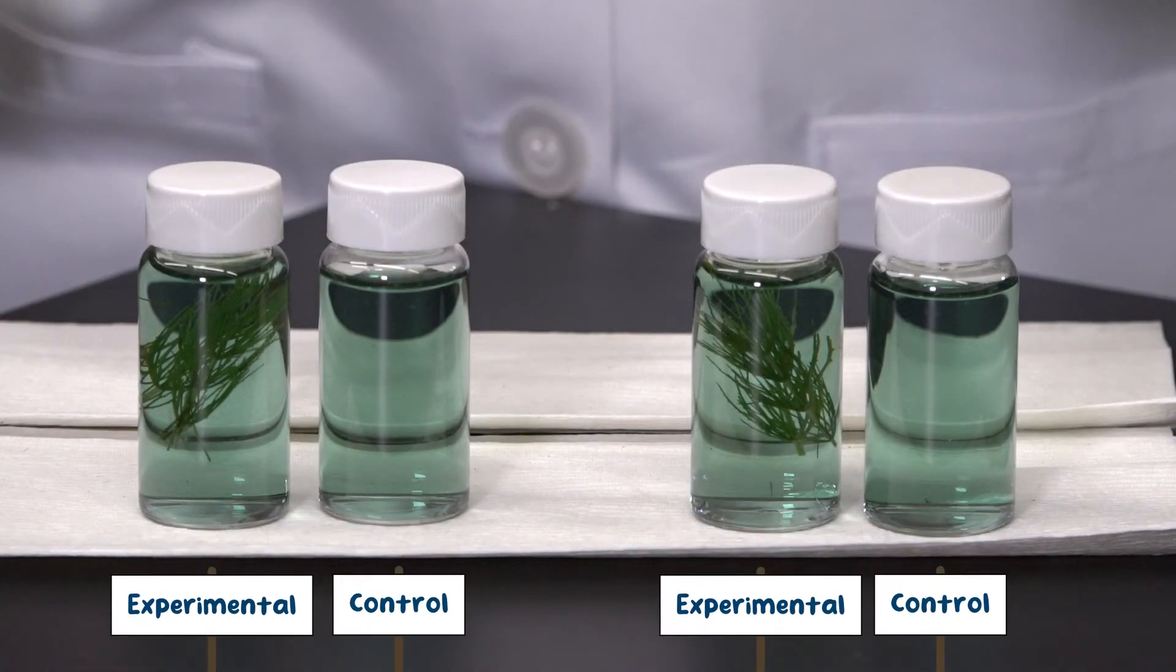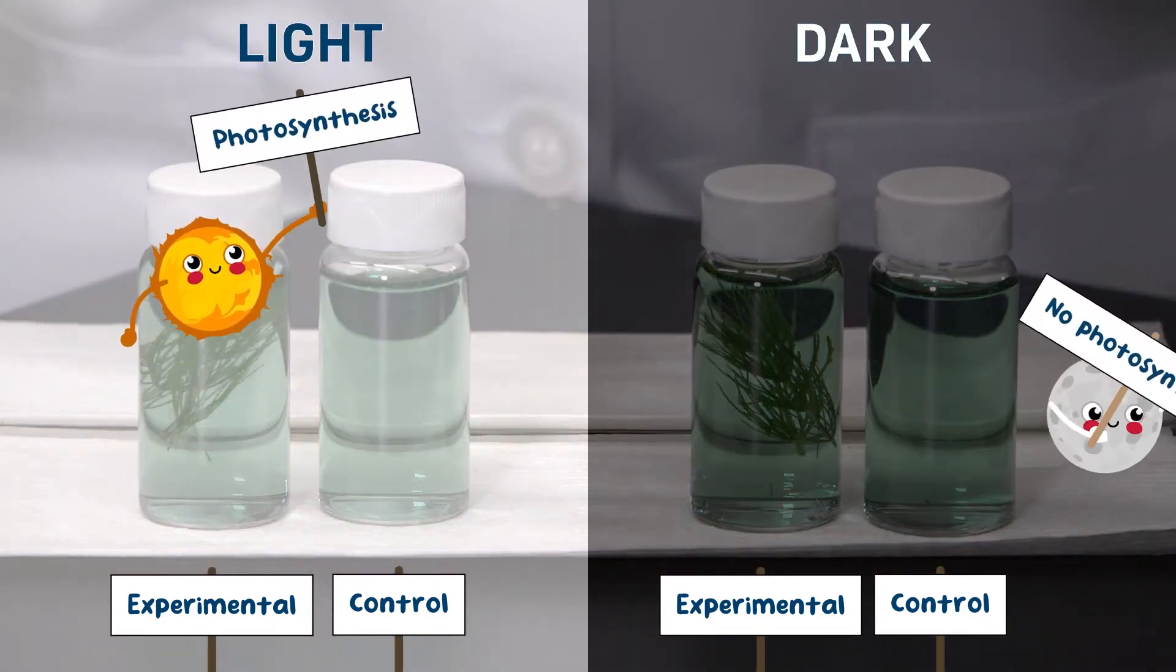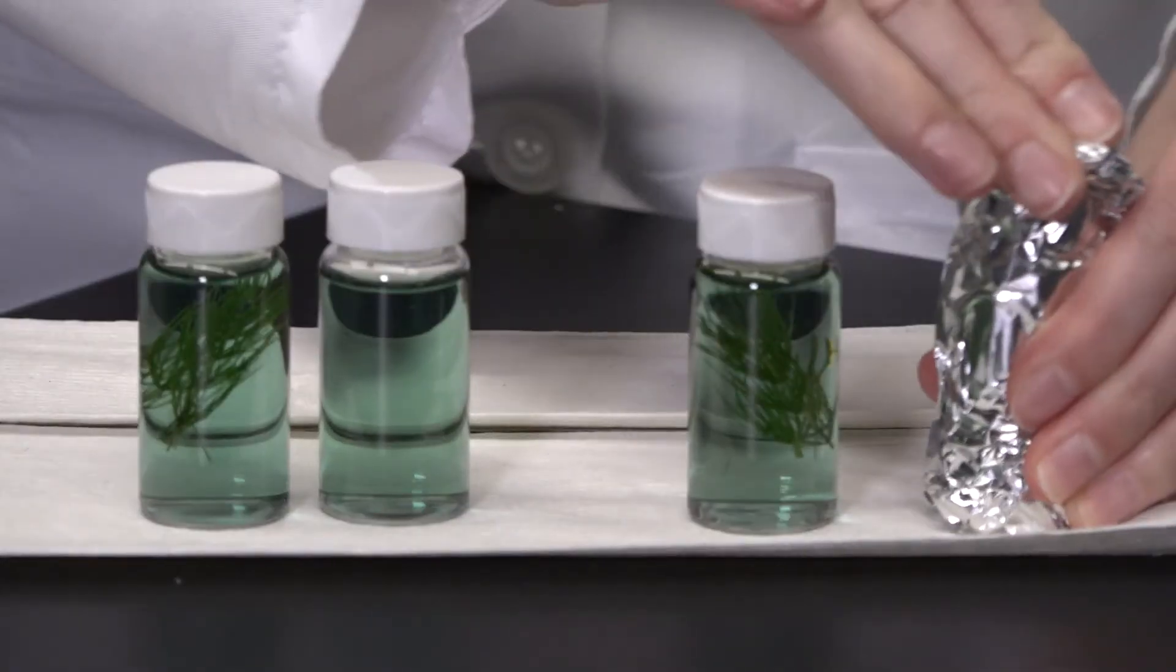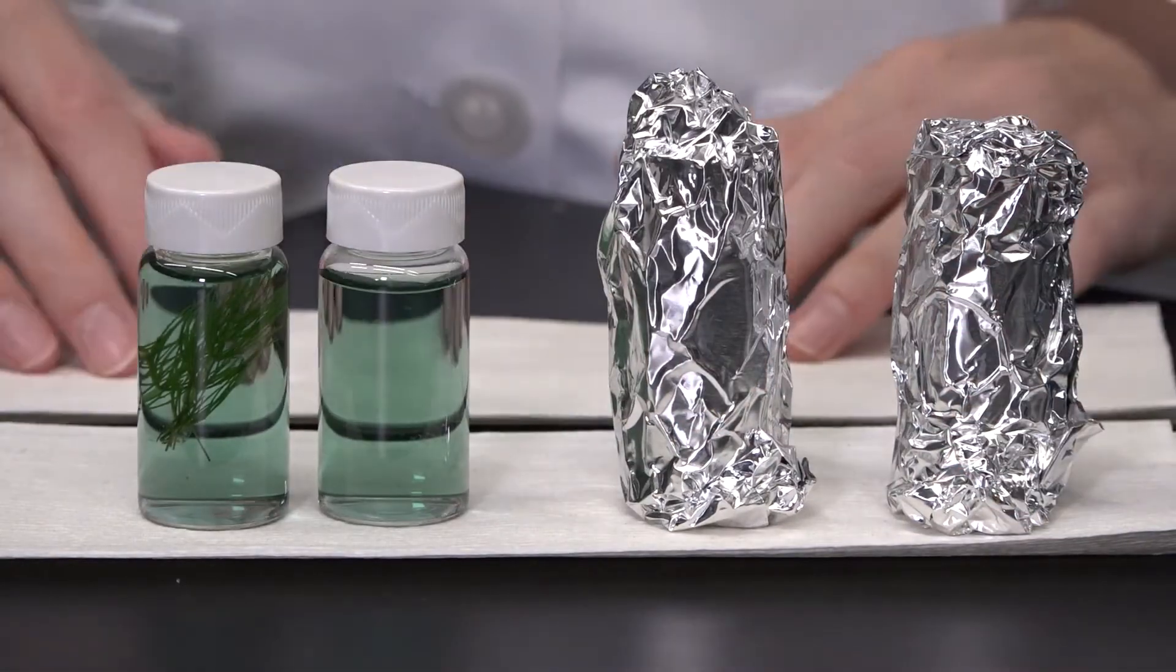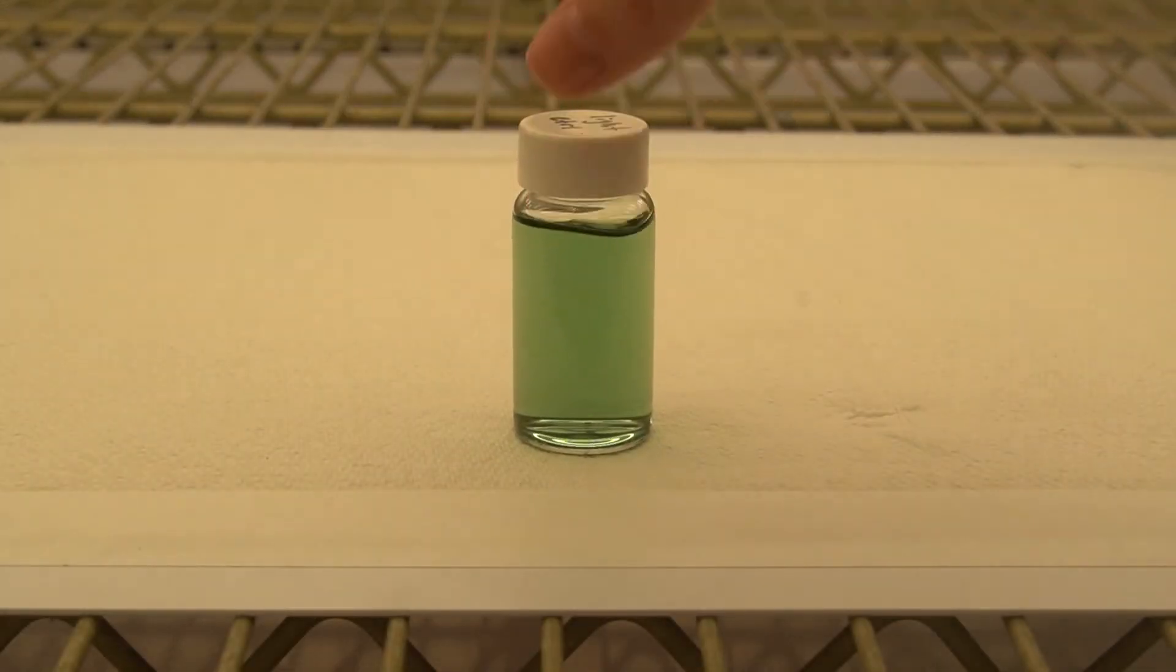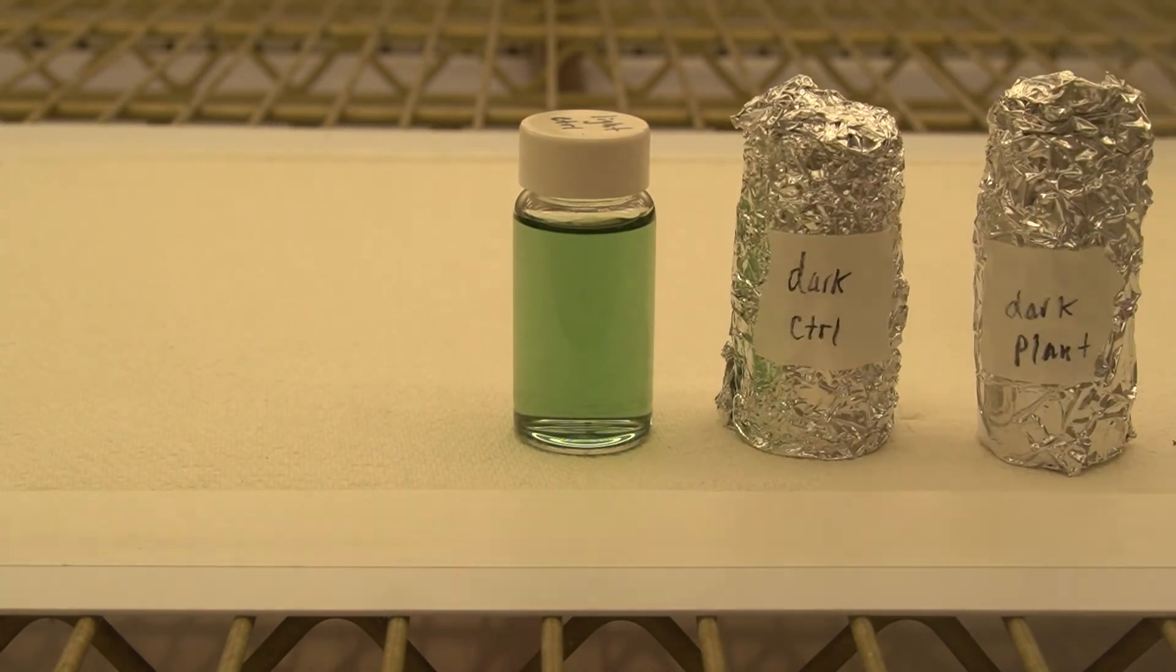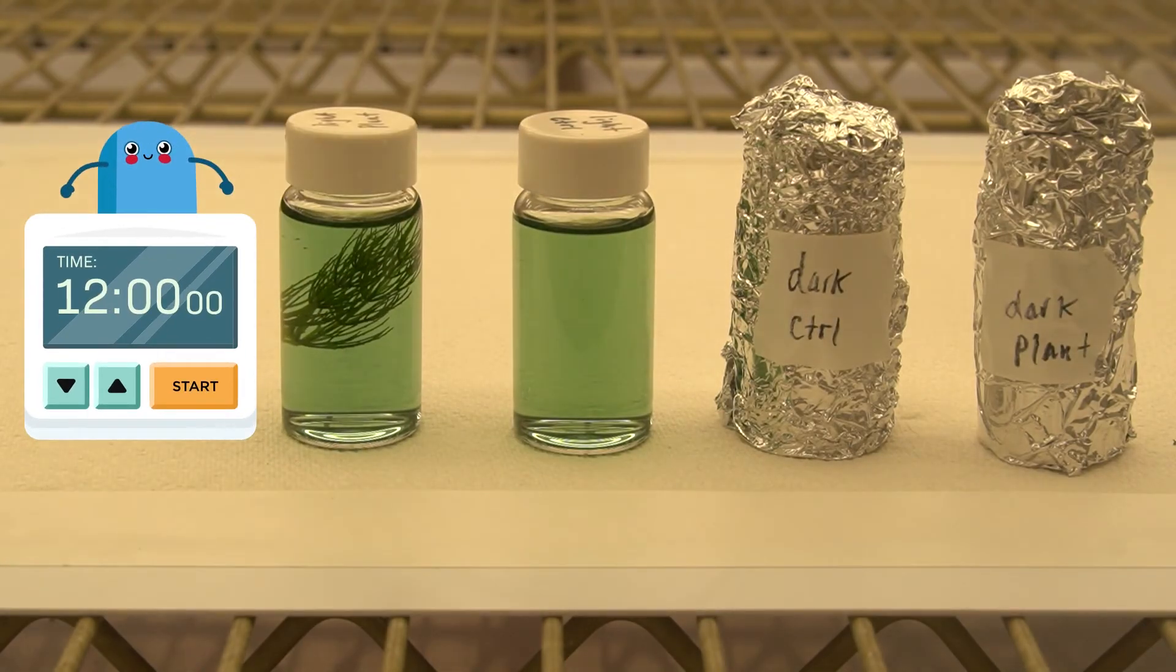The experimental treatments are light and dark. So one plant vial will be doing photosynthesis, one will not. To ensure no light can get through to the dark treatment, let's wrap one plant vial and one empty vial in tin foil. Then put them all near a bright light source. We want to keep the dark vials close by so they experience the same conditions, such as temperature, as the light vials. We're going to leave them here for 12 hours.